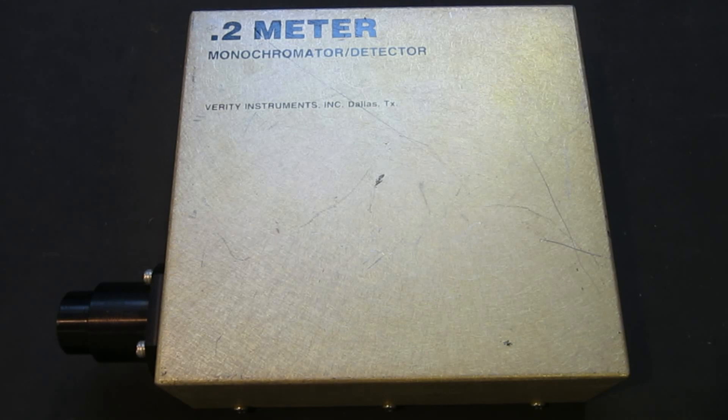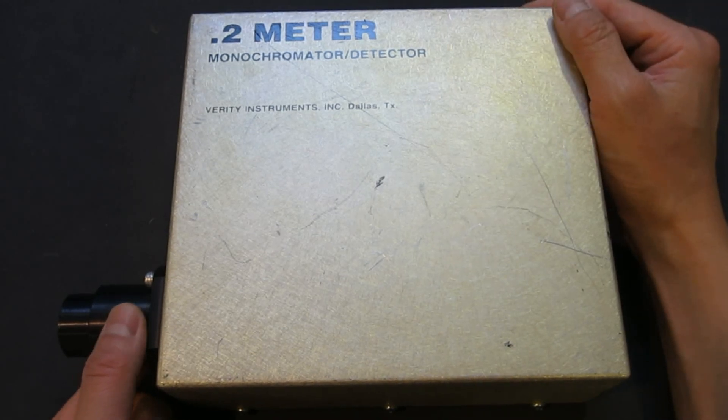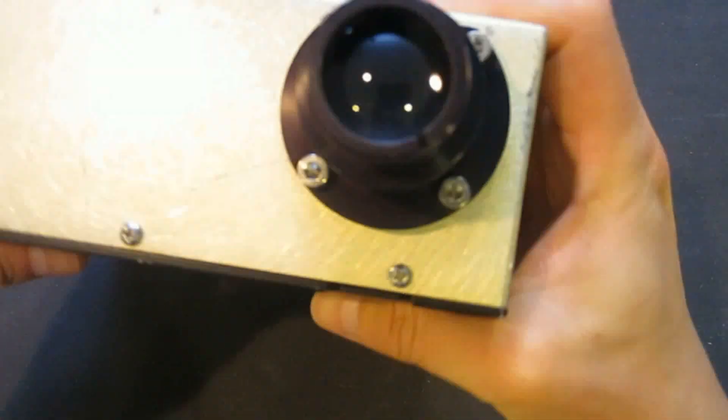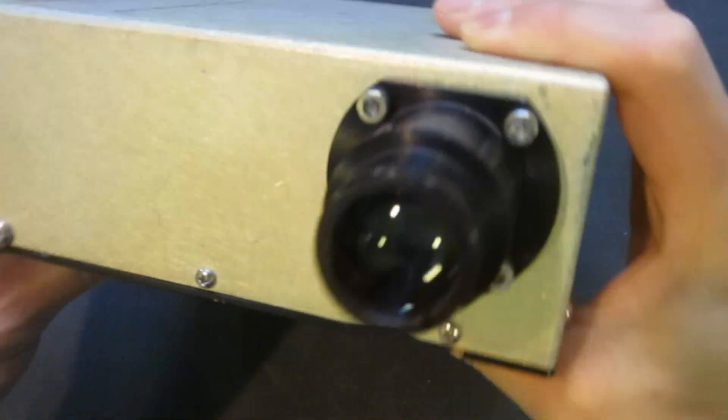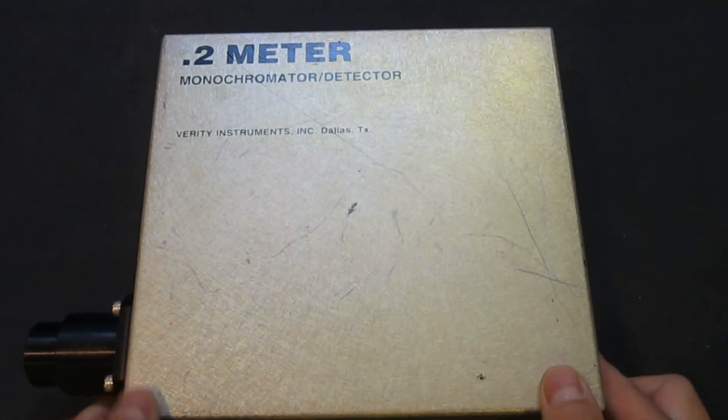Like the one you've already seen on the Signal Path, this one also has a manual adjustment. What is different is that this one has this optical coupler, which is a combinator for the lights to concentrate the light beam.